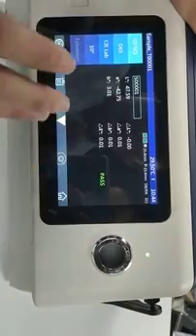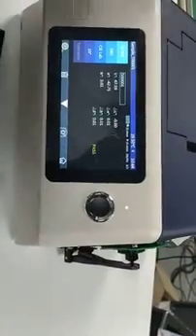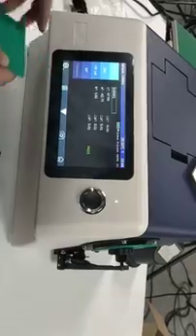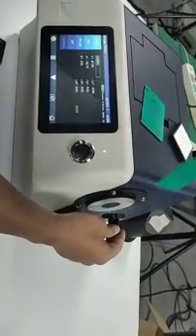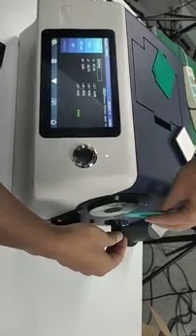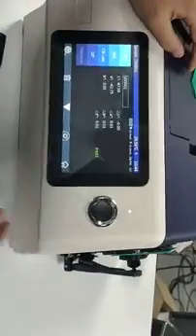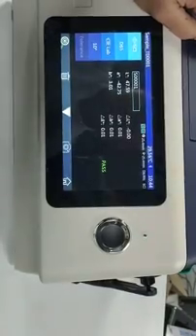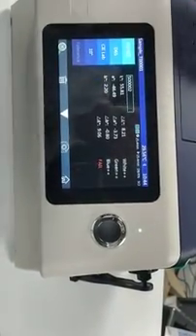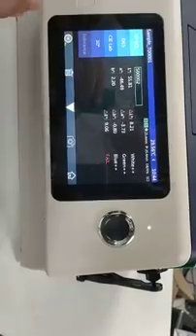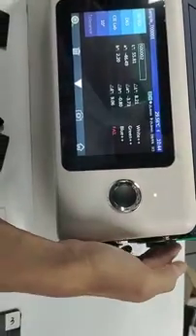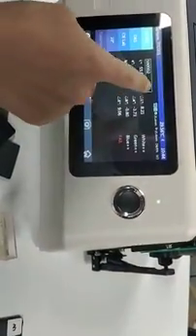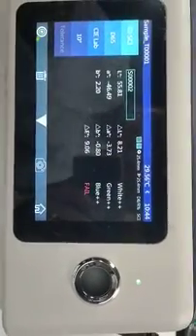This is repeatability. And we use another sample. Another sample. Another sample. Ok. This is the color difference between the standard here and the sample here. It's color difference is, ok, you can see the result.